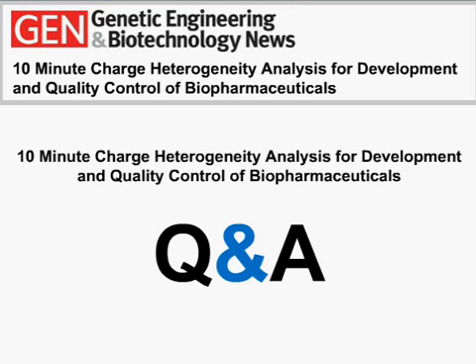Okay, and Karan, have you ever seen that using urea while improving protein precipitation issues also decreases your resolution? That is a good question. We do have products which do not require urea to keep them soluble while they are focusing. So when we look at the electropherograms of these products with and without urea, we see that there is virtually no change in the resolution. So I would say that we haven't seen any of the bad effects of urea on resolution, and it only seems to improve it and keep it more reproducible.